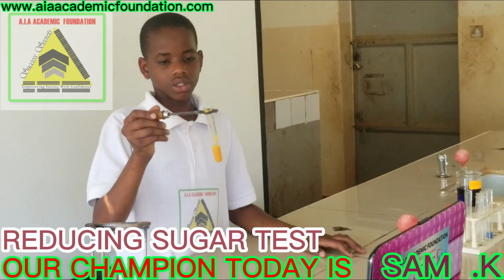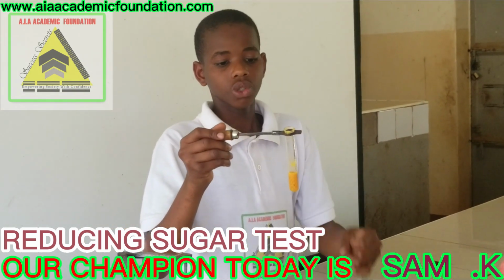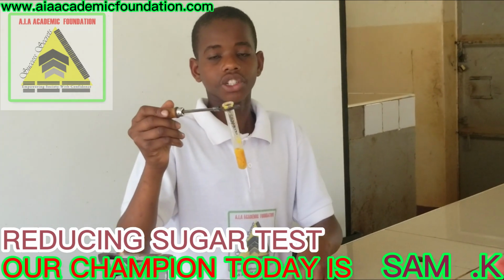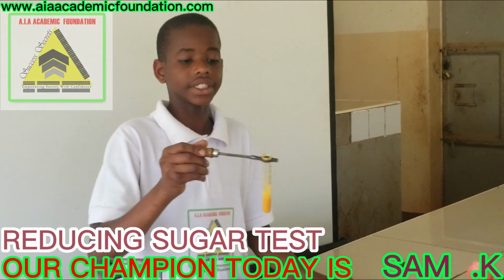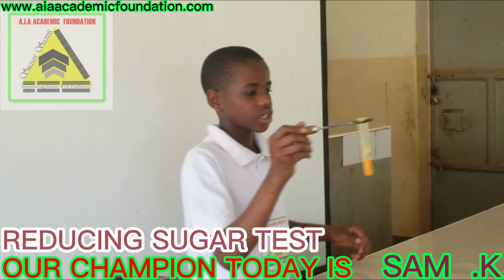So we observe that this solution turned from a pale blue solution to a green solution. Then from there turned to a yellow precipitate, then finally to an orange precipitate. So we conclude that milk contains reducing sugars.